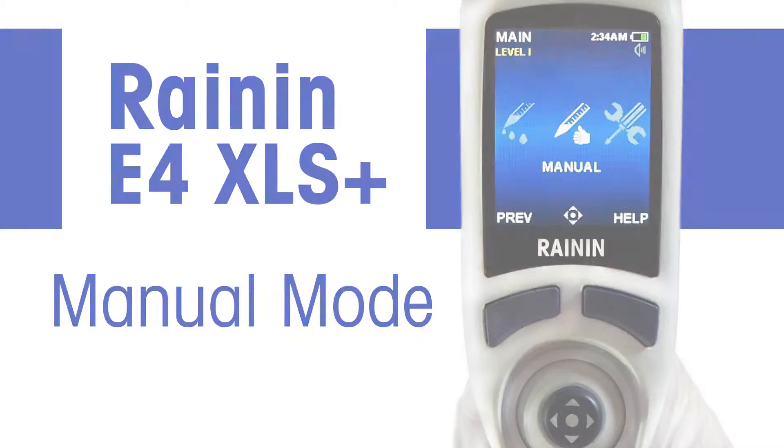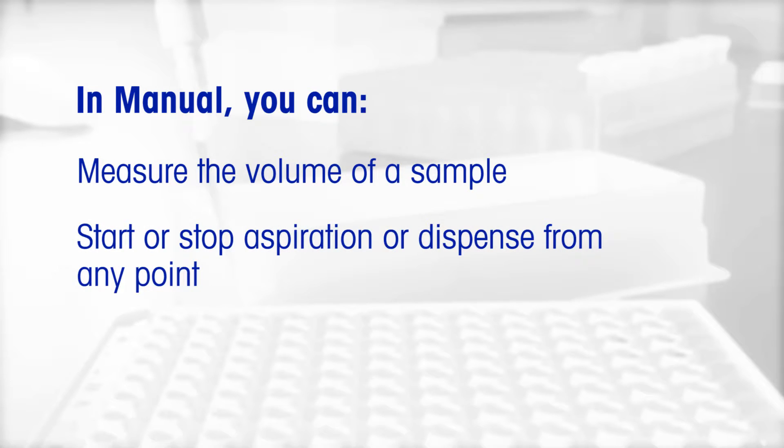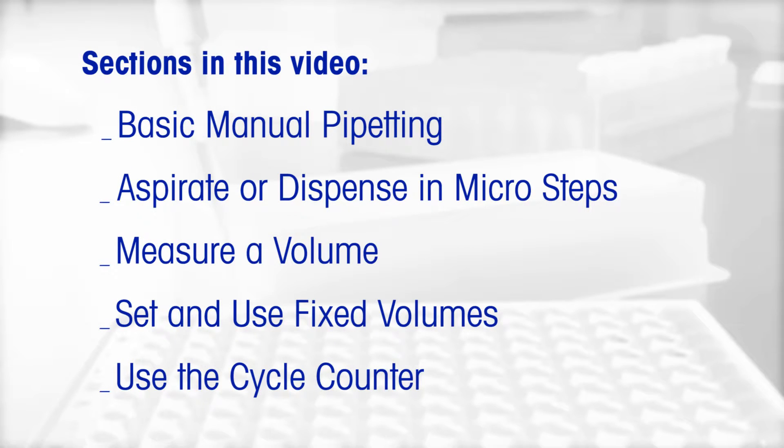In manual mode, you can measure the volume of a sample, start or stop aspiration or dispense from any point, and actuate volume in precise motor-controlled steps. Sections in this video: basic manual pipetting, aspirate or dispense in micro steps.